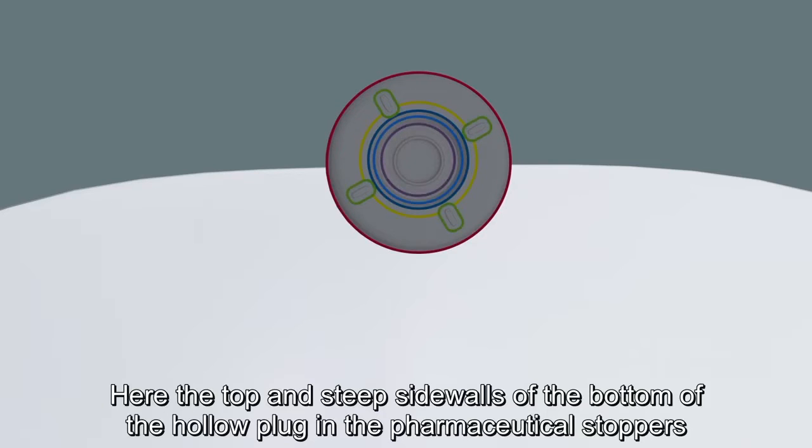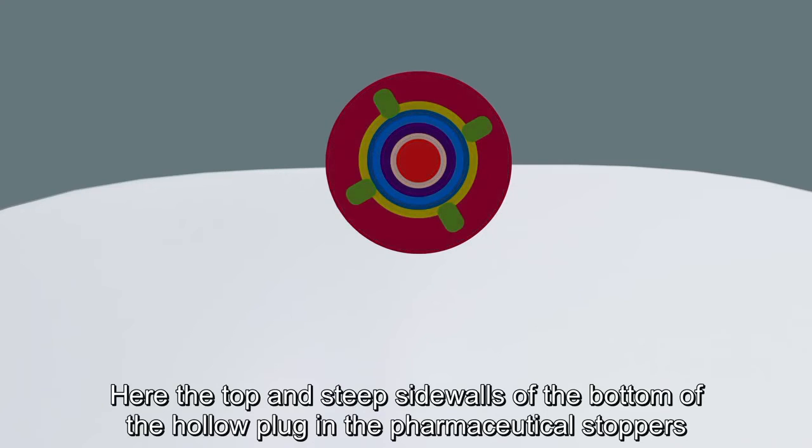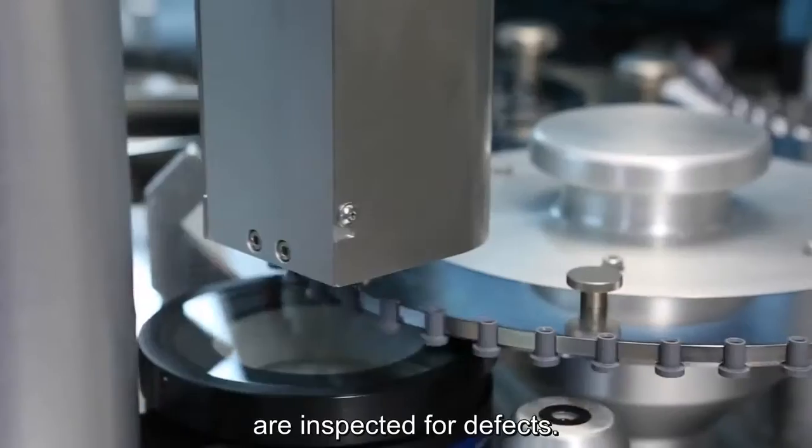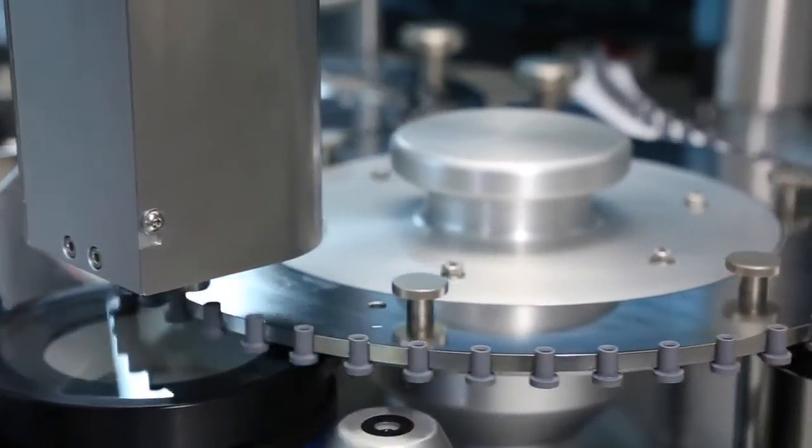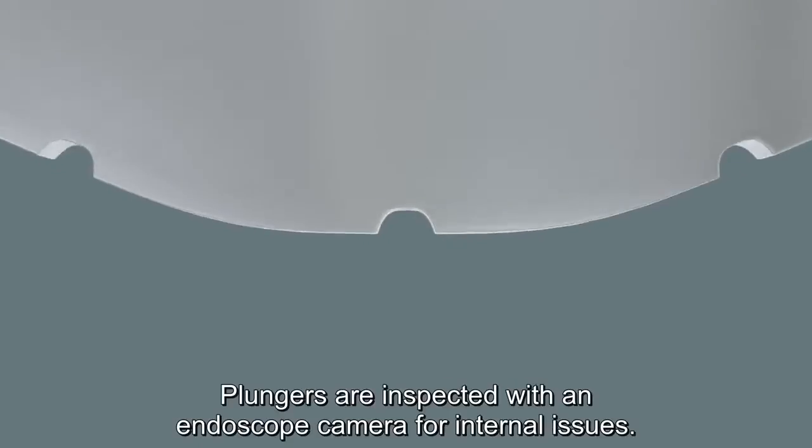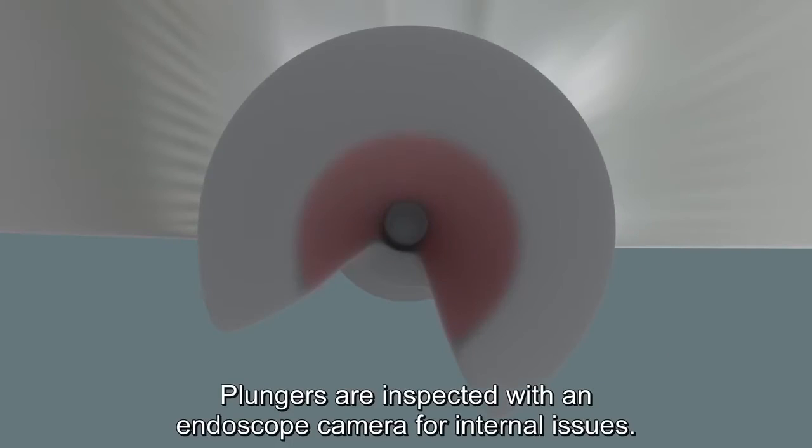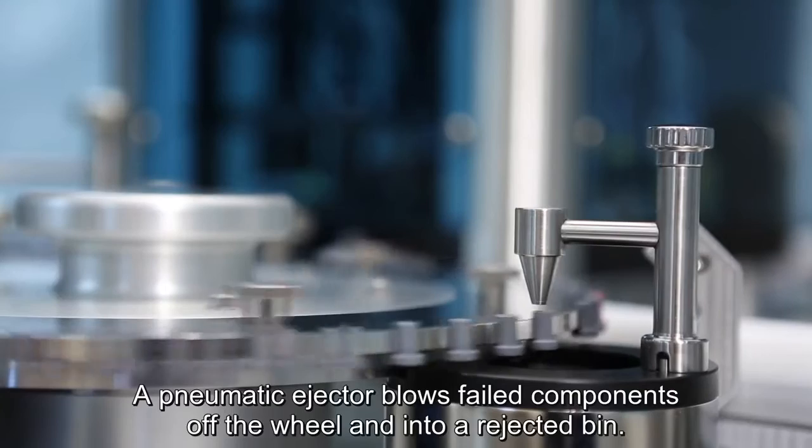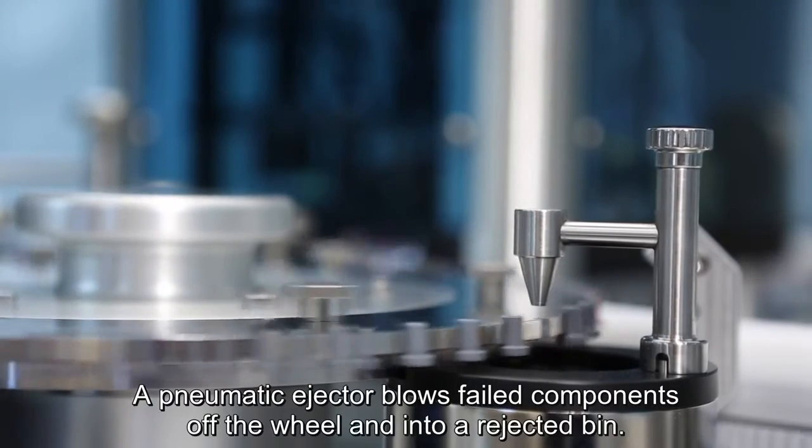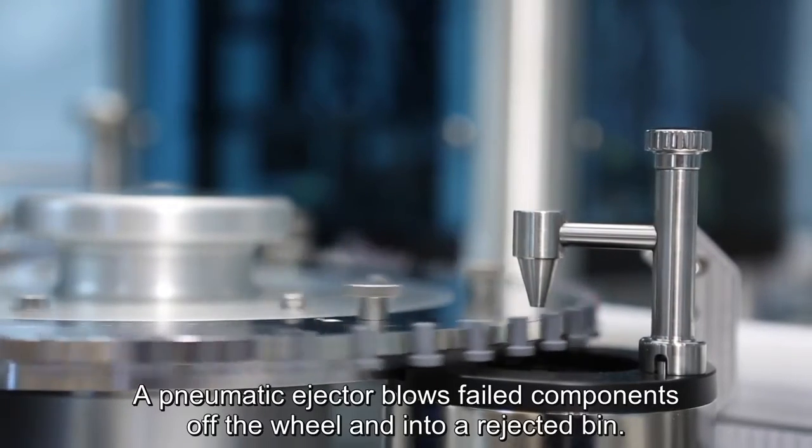Here, the top and steep sidewalls of the bottom of the hollow plug in the pharmaceutical stoppers are inspected for defects. Plungers are inspected with an endoscope camera for internal issues. A pneumatic ejector blows failed components off the wheel and into a rejected bin.